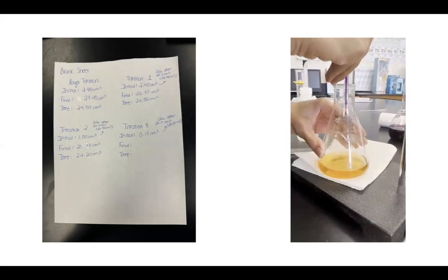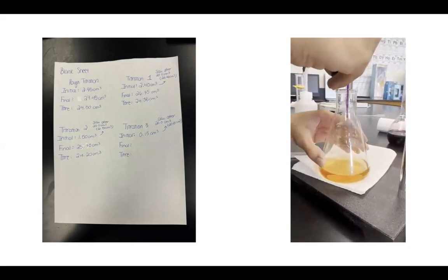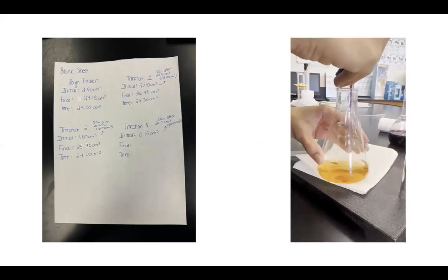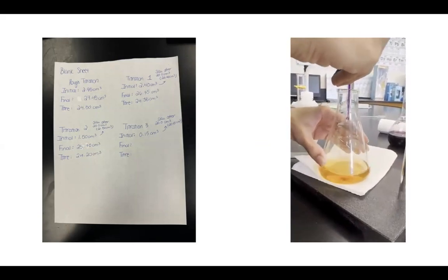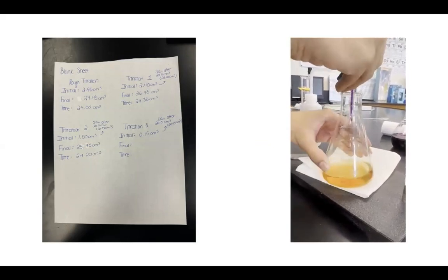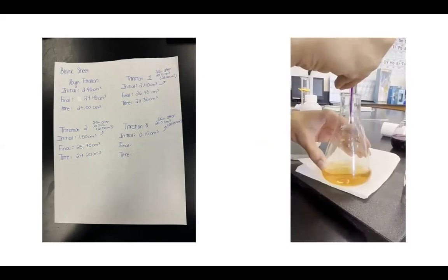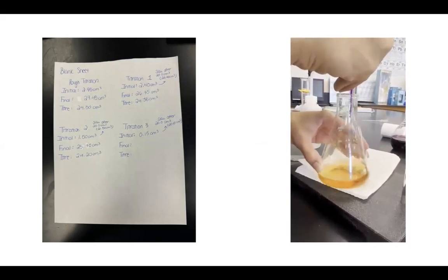So now that pinkish color is again starting to appear, so we know the endpoint is near and we're going to go very slow. Again, the slower you go, the better it will benefit you because then you don't have to do more titrations and you're more likely to get concordant values. So don't rush because in the end, you're just going to waste more time.